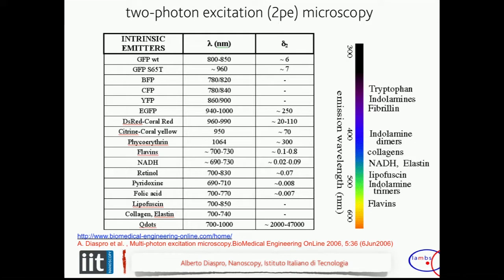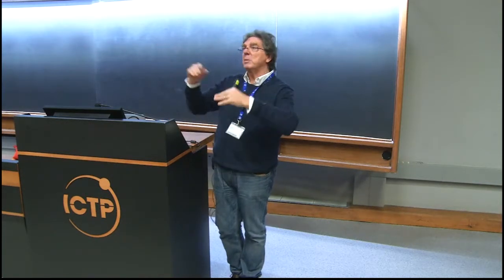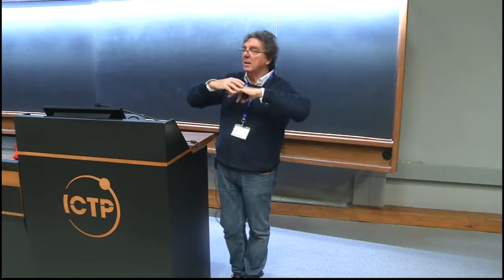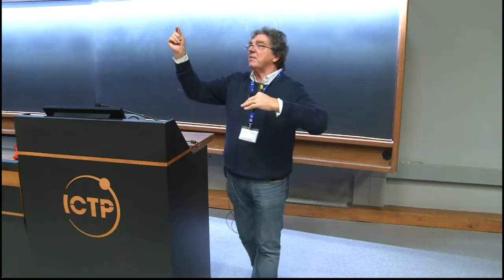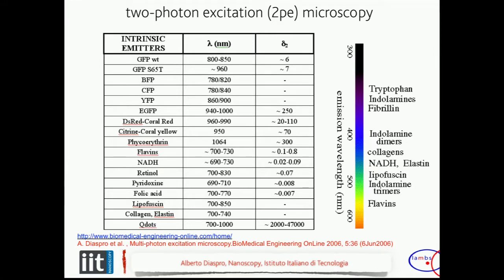A nice surprise. When you move to two-photon excitation, there is a rule that is not strictly true if you go to the formulas and the real structure of the molecule, but it is practical, a rule of thumb in some way. The rule is that if I shine 720, it's like exciting 360. Okay? It's like exciting 360. But through my sample, light at 720 is passing. Only in the focal region do I have an effect that is exactly as if I were shining 360 in a very precise position. So I'm affecting a very small region.